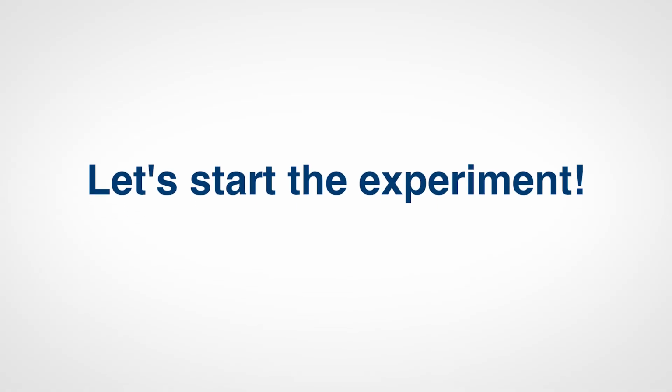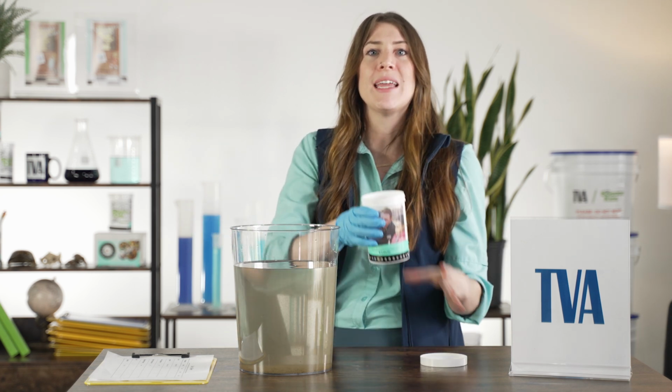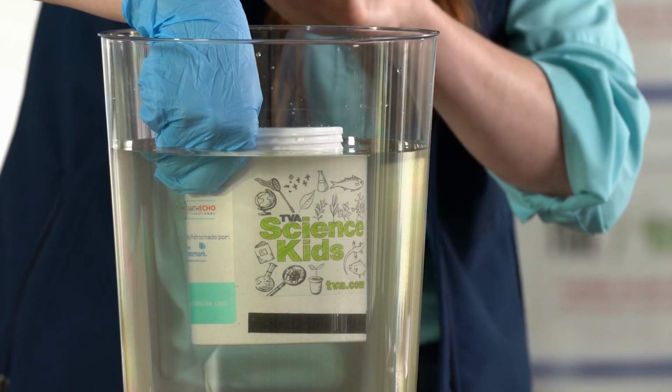I'll go over some directions, then you'll perform the test. For our first test, you're going to place the glove on your dominant hand. This is the hand that you use most, and most often the hand you write with. Then take the lid off, and you're going to put your thumb inside the beaker and hold it just like this. Dip the beaker into your bucket and completely submerge it. That means there's water on the inside and water on the outside.